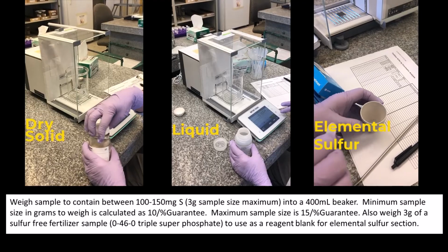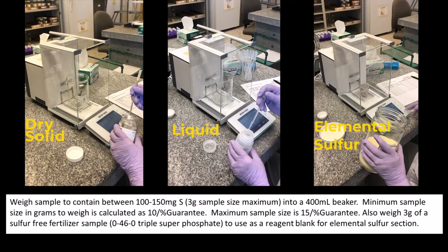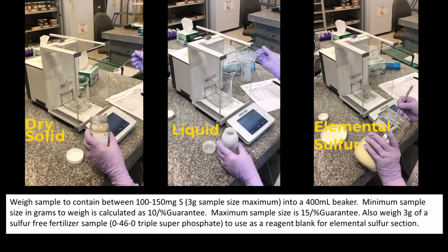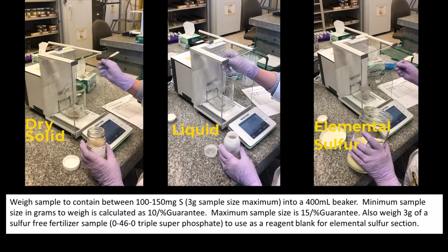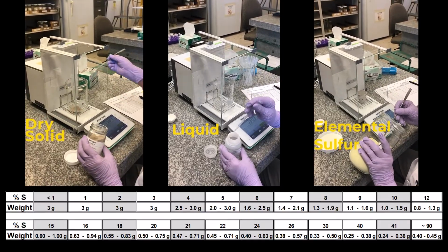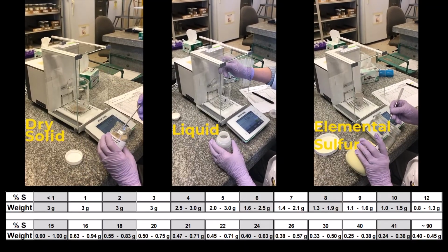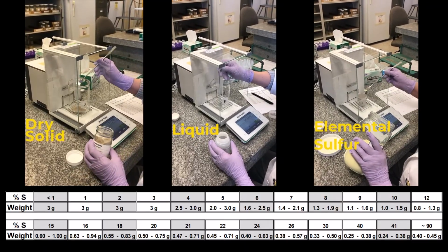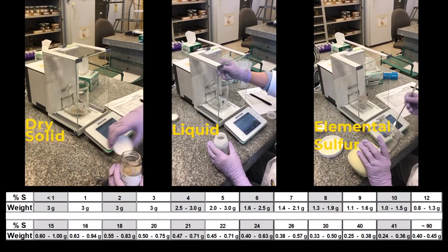Now we're going to demonstrate the laboratory analytical procedures using 3 different sample matrices: dry solid, liquid, and elemental sulfur. We weigh solid and liquid samples into 400 ml beakers, with elemental sulfur directly into Gooch crucibles with filters. Recommended weight ranges are shown in the table below.